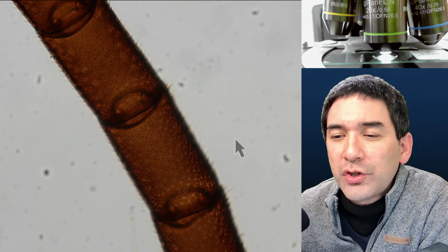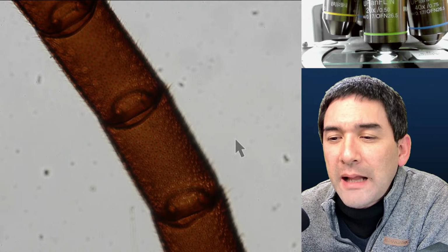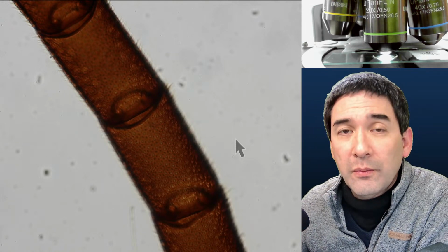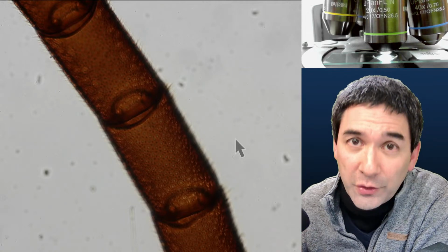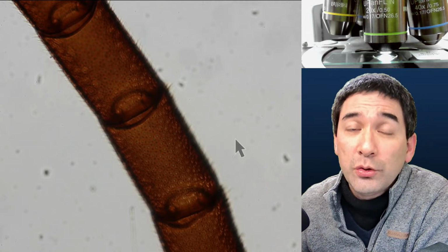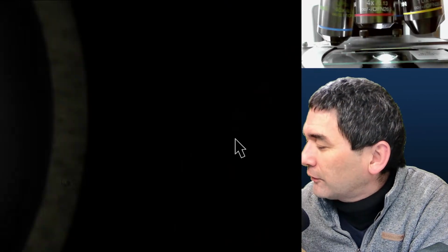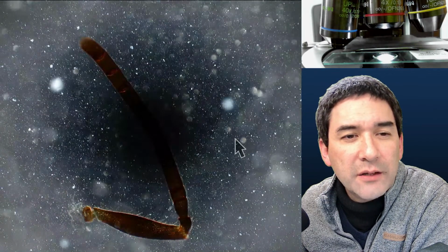There's some other question. Hello, I'm new to microscopy here, and I've been watching your videos to get the black background in some of your pictures. Is it a separate dark field microscope or different lens or something different? Well, I do have a separate one, you can easily convert a bright field microscope into dark field. But what I've got over here is a dark field only for the low magnification. Yeah. So that is kind of dark field.